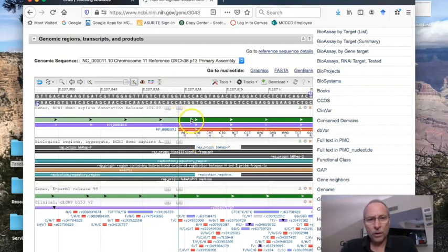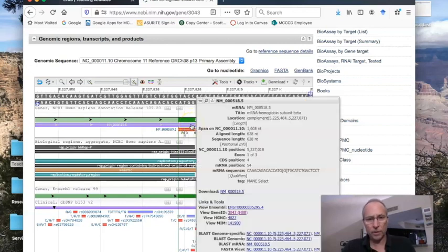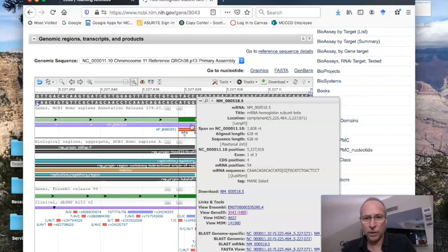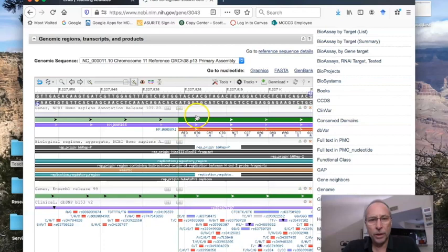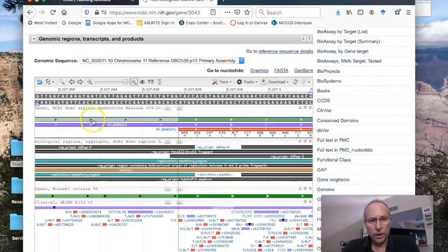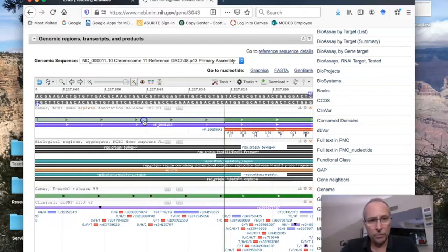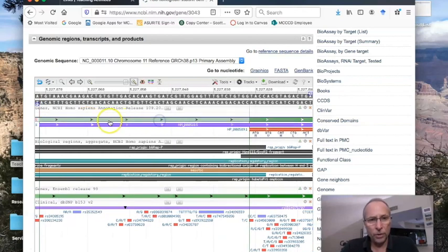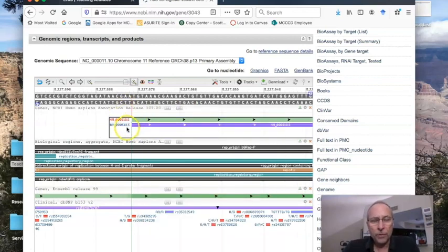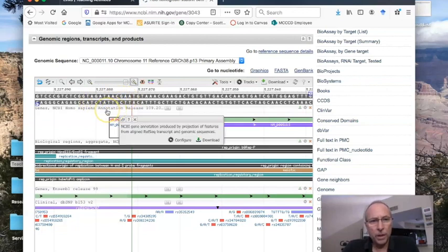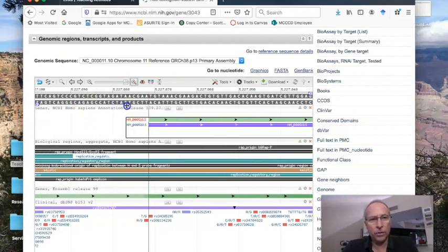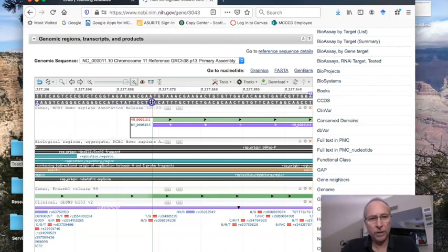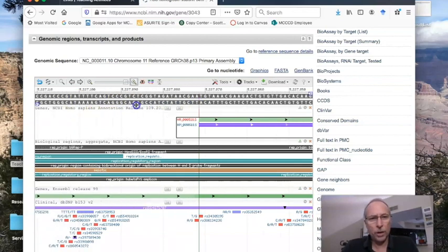So there are times when you get information about introns and exons, you have to cursor over the messenger RNA sequence. This tells you what's going on. This is the beginning of the coding region. So if you remember, up here upstream, this is the section that is part of the promoter that's also transcribed. If we come this way and see where the messenger RNA starts, it starts right there. If you recall the structure of your genes, this promoter region continues to the left, and there should be a TATA box here, the sequence that attracts the transcription factor and starts the transcription process.